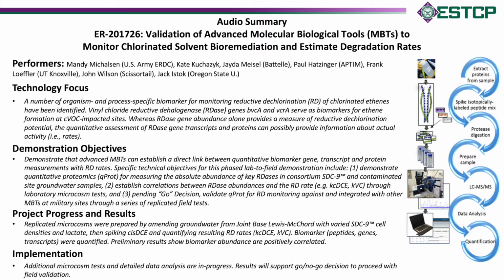During the last several years, our team has developed protocols for the extraction, digestion, and analysis of proteins from complex environmental samples, including sediment, soil, and water. Following extraction, proteins are digested, purified, and analyzed via advanced mass spectrometry.